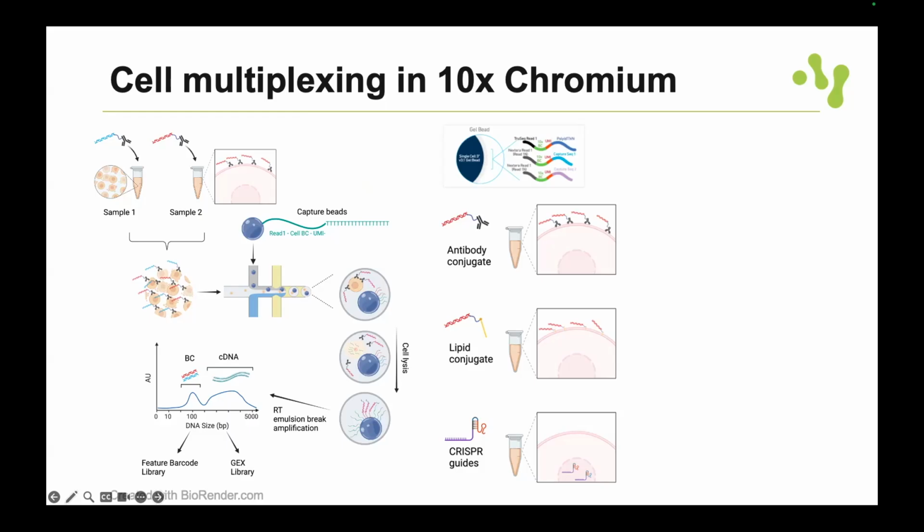If you put more cells in one run of 10x, you need to sequence more, so you need to sequence deeper. It's always the trade-off of amount of cells versus sequencing depth, how many reads you get per cell, that needs to be optimized. Did that answer your question? Yeah, I think so.